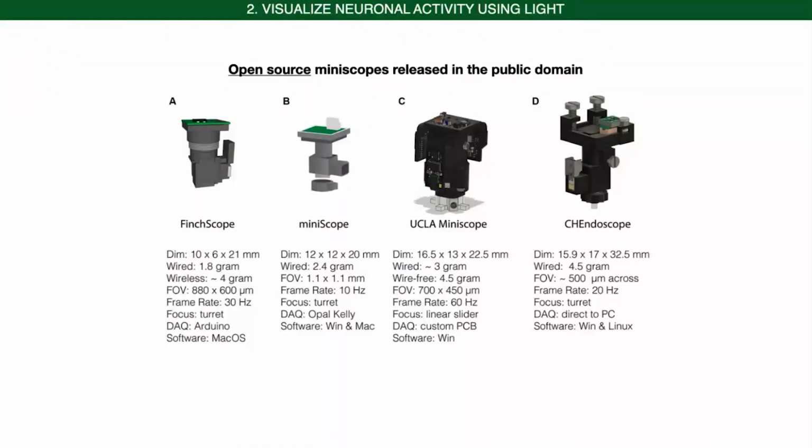The cool thing about the miniaturized microscope and neuroscience in general today is that a lot of those tools are open source. So you can even build your own miniaturized microscope, by buying the different components, and you can eventually even customize it to make it better for the performance that you are looking for in your specific experiment.